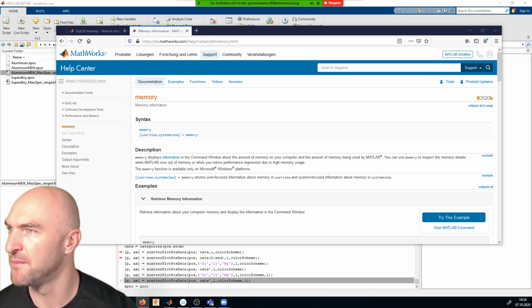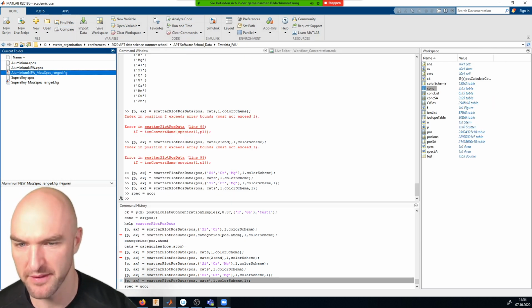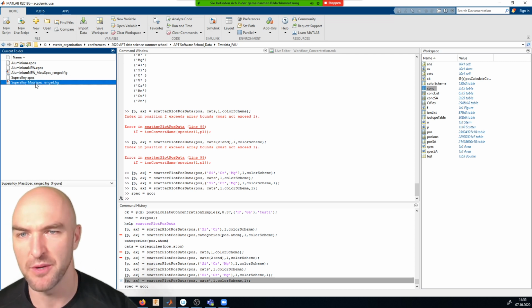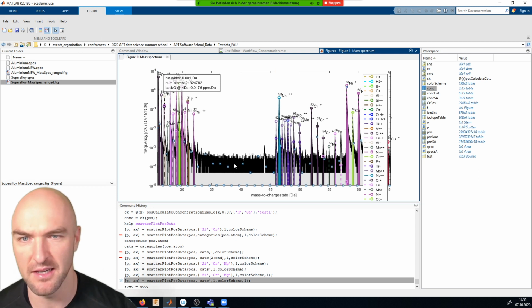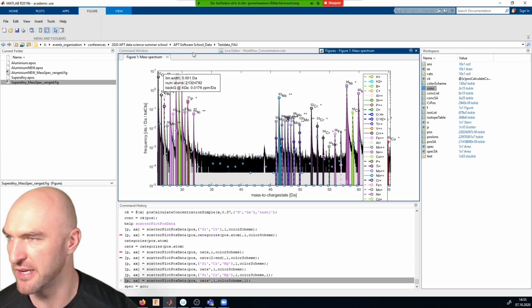Okay, so your spec SA is obviously not a graphics object. When you open the spectrum, and I can just do that for you again, you might have clicked on one of the ranges or one of the ion plots. If you go somewhere where there's nothing in the vicinity, then you can be relatively sure that what you click at is actually the mass spectrum.